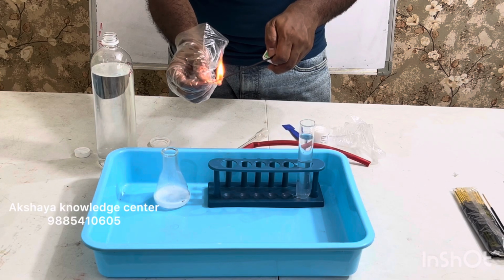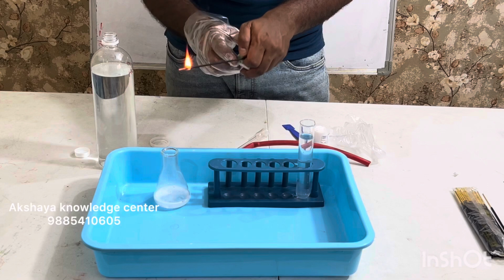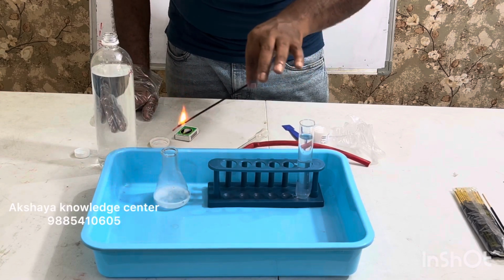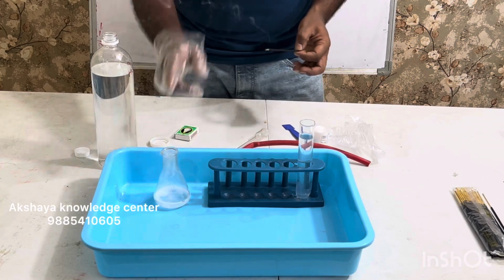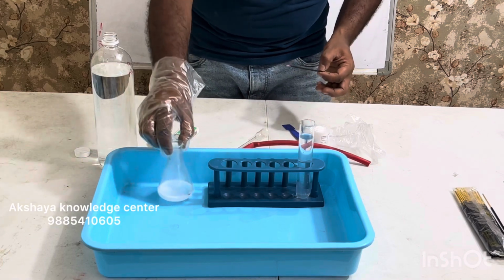We know that this flame is getting put off. That means the gas that is coming out will not blast anything. So now I'm going to place it even inside. And when I place it inside, you can see it's immediately getting put off. That means the property of this gas is to put off the flame.